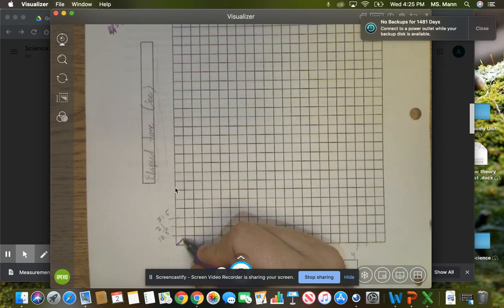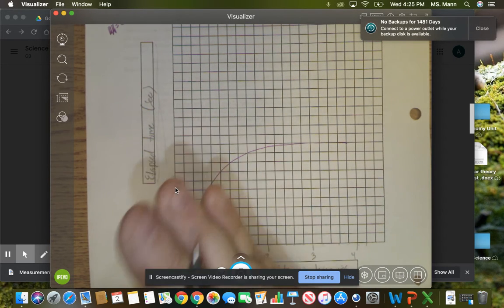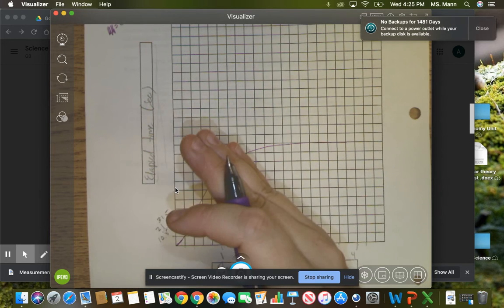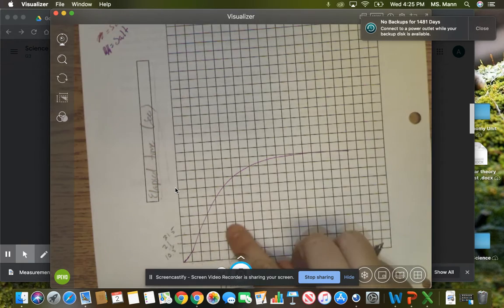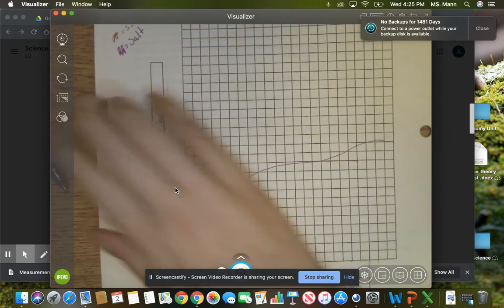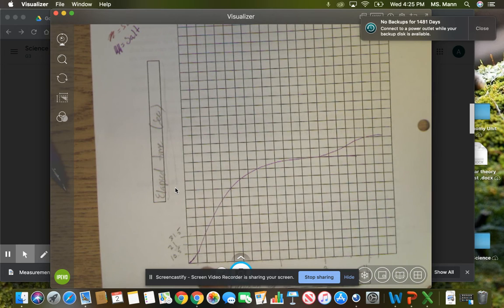All right, so say this is my general trend line. Again, this is not accurate. This is just me demonstrating how I want the graph to look. So salt is purple, so I made a purple line, right? So I made it a little bit exponential. So I made a purple line, so I can clearly see that this trend line is salt.